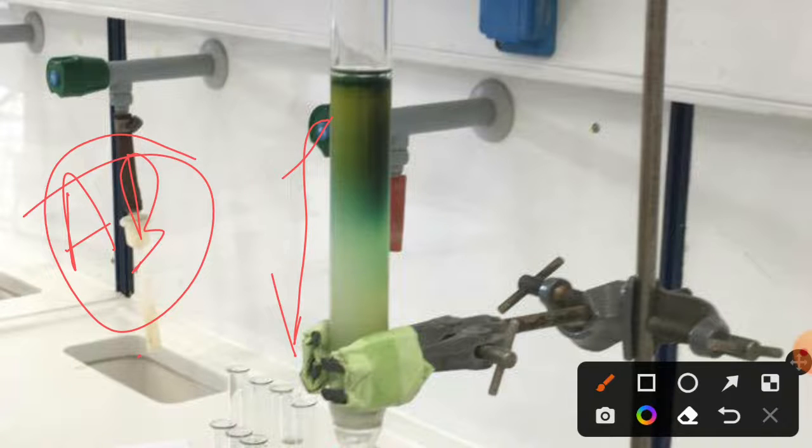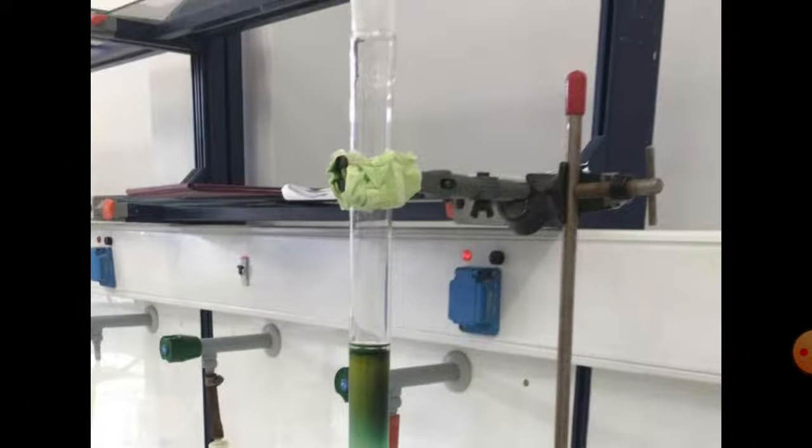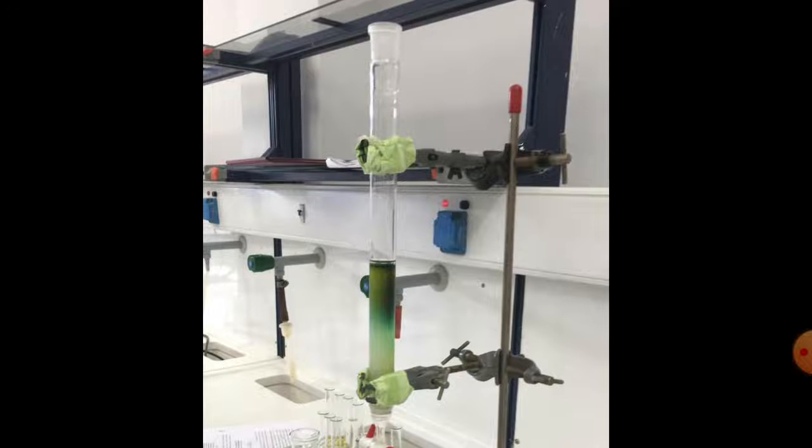So column chromatography can help you to separate impurities from an important compound, and it can also separate metabolites, okay, and it can also help you to determine various components in a particular drug, okay, and it can also help you to analyze the presence of phytomenadione in drugs and injections, okay. So those are the utilities of column chromatography.